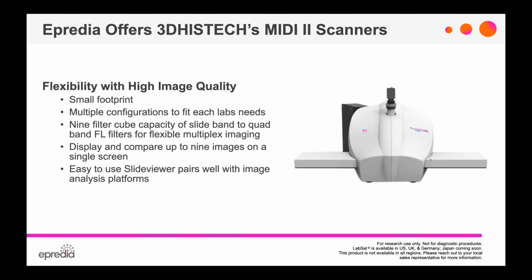And each of those filter cubes are able to hold anywhere between 1 and 4, so single to quad band filters. So you really have a full spectrum of filters at your availability at any given time without having to go in and make manual changes to the instrumentation.